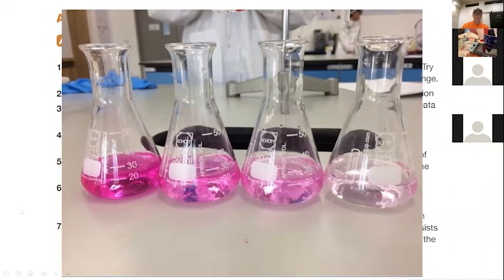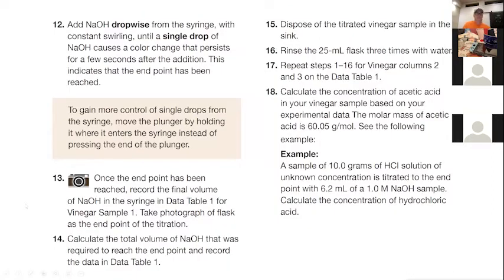Did you want us to take pictures? It says to take pictures. Yep, before and after. Remember to use the template that's provided. That's why we provide it for you guys to use. You don't do it every time. Basically, do your best one. If you have a really good one with a really pale pink color, that's the one to use. So a before and after shot: before you added sodium hydroxide, and at the equivalence point, or for us, the end point. And these pictures you want us to put in the lab report? Yep.